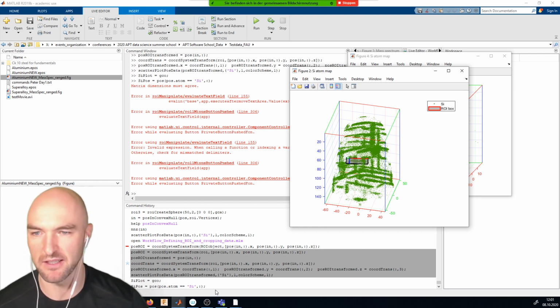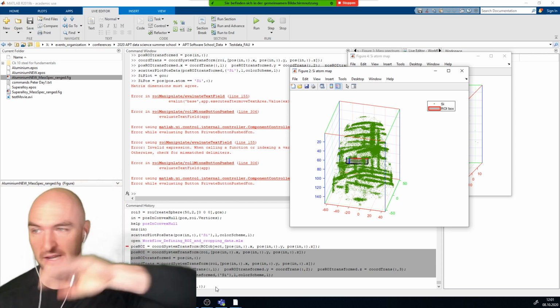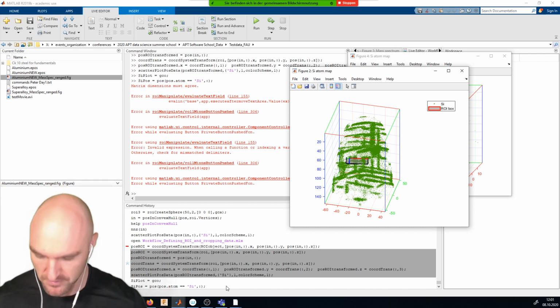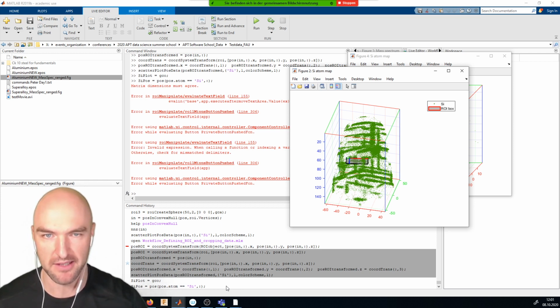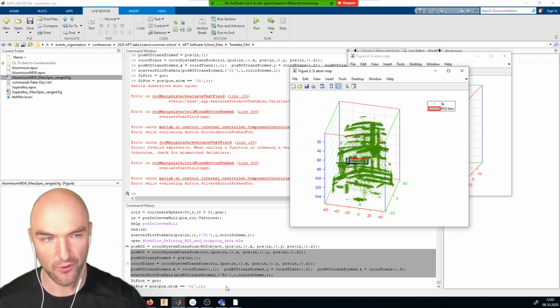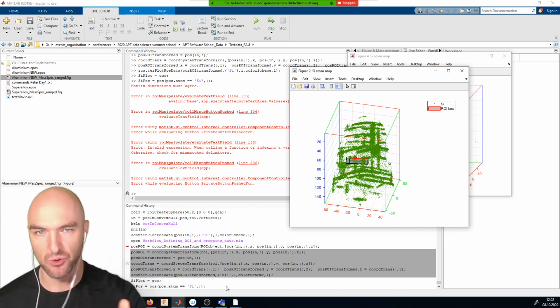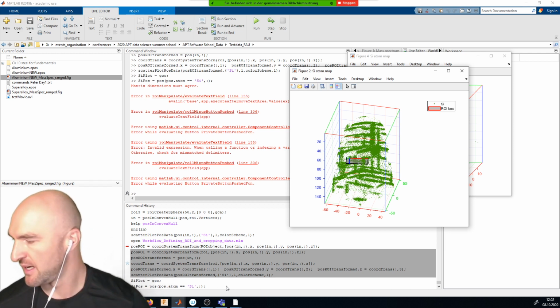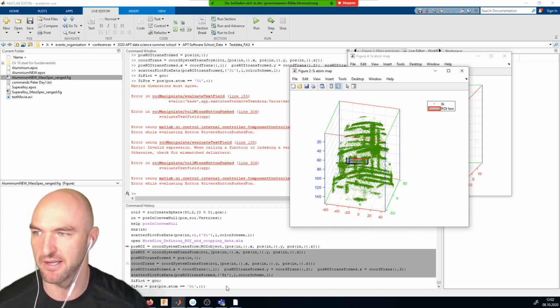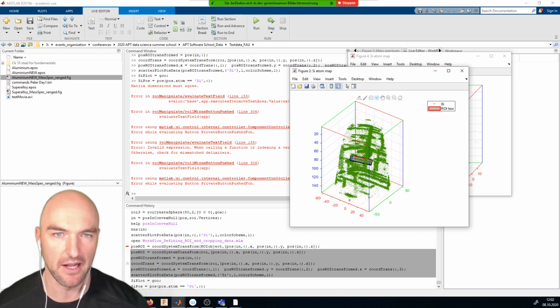And since we still have half an hour, I will show you how to do that so that we have a little bit more time in the ND analysis section, because this is going to be a little bit more involved. Thus it's good to have a little bit of extra time. Okay, so a 1D concentration profile along the x-axis. So you already know how to calculate concentrations for an entire volume. Obviously, doing that just for the ROI is fairly trivial because all you need to do is look up which atoms are in the ROI and then calculate it for the ROI. I don't think I need to separately explain that. But now we might want to calculate the 1D concentration profile along the x-axis.